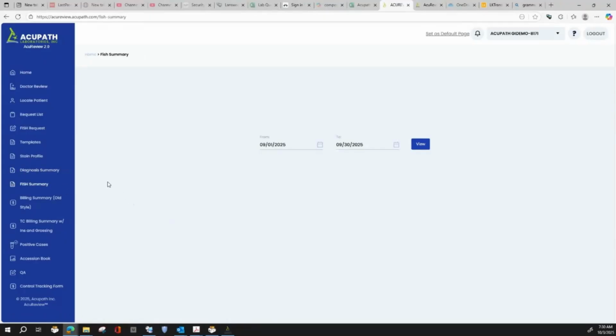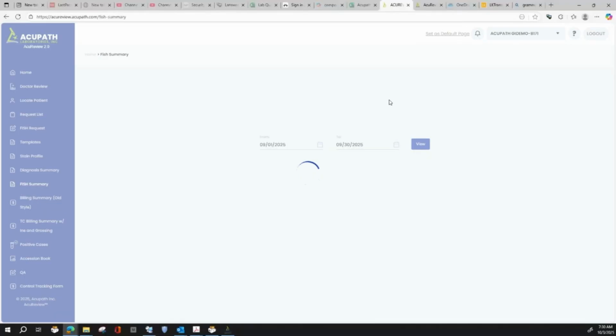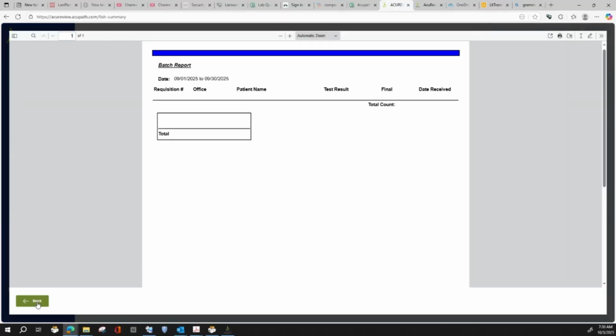Fish summary is going to give me a summary of fish requests during that period. And in this particular account, I don't have any, so it's going to come up with a blank report.